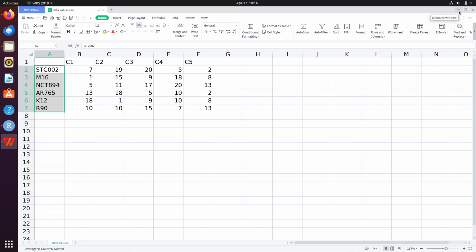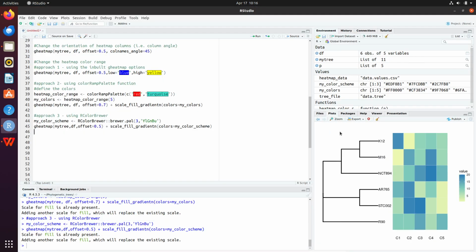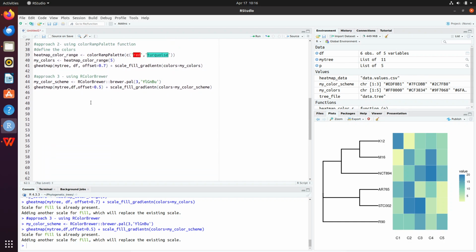Let's say we want to specify condition, or maybe it's a profile, something like that. Or let's say count. Then, all the more reason why you also need to learn how to change the legend's title. Okay, so legend title, we are also going to do it here. That will be the last thing I'm going to do.